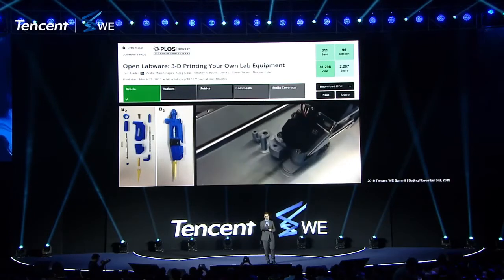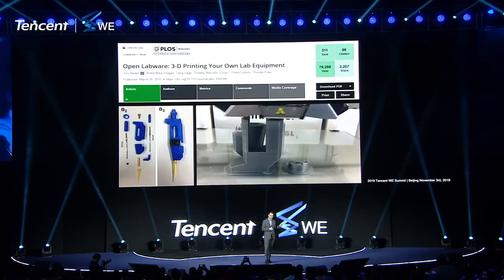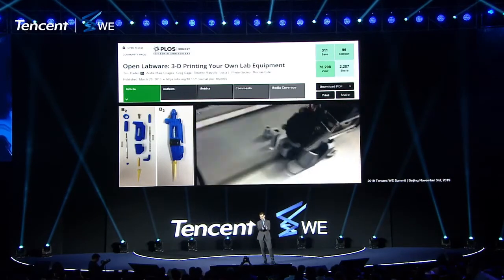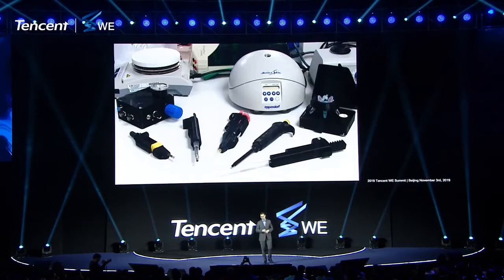And I should point out that we didn't invent this pipette. I saw a different pipette online. We modified it, and we put this one forward. And then others saw this pipette, and they say, hey, this is great, but you did this part really stupidly. You should change this bit. And the beautiful thing about that is they didn't need to tell us that. They could just take the design, change that bit, publish their own pipette, say, look, these guys' pipette is this good, mine is better. And then the next guy comes along and says, okay, this pipette is great, but I can make it better still.